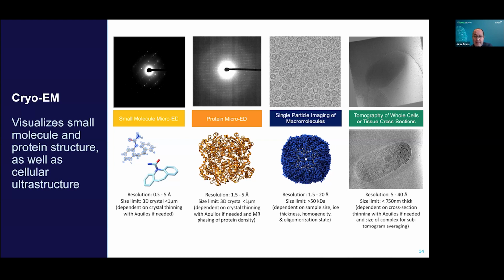That's what you see in the blue column. On top is a cryo-EM image where the black or darker densities are representative of the protein scattering on a water or buffer background. And below you can see an overall reconstruction. With this approach, without crystallization, you can still get 2 to 3 angstrom resolution in many samples.